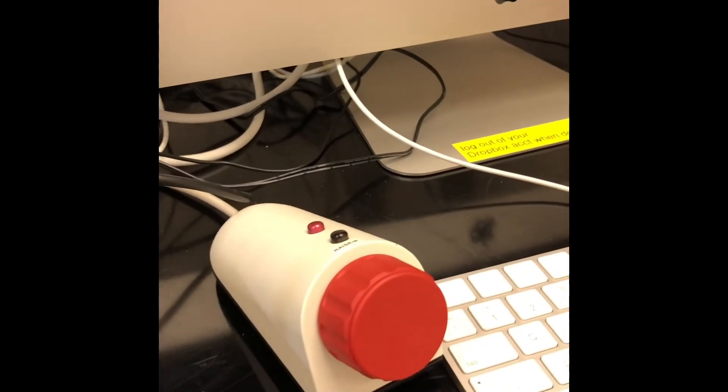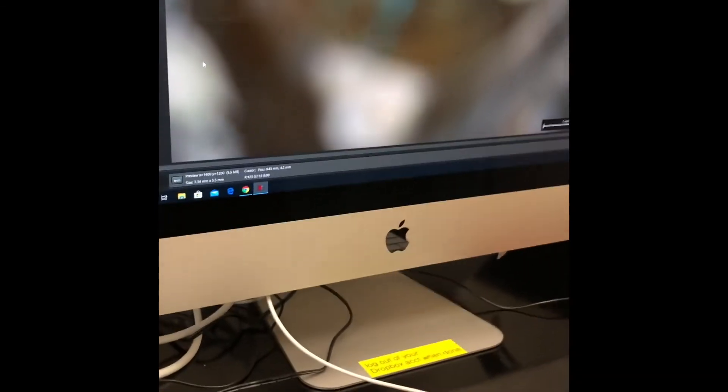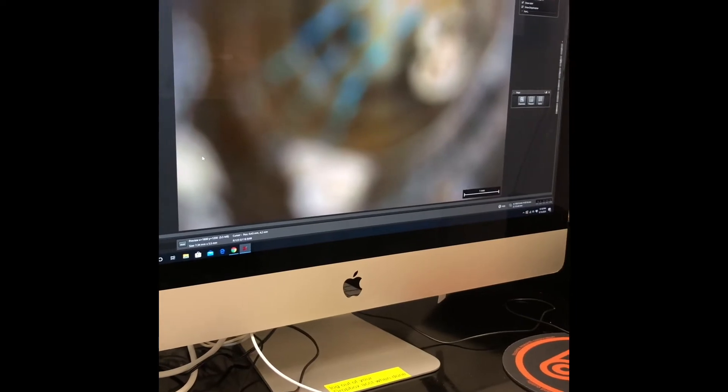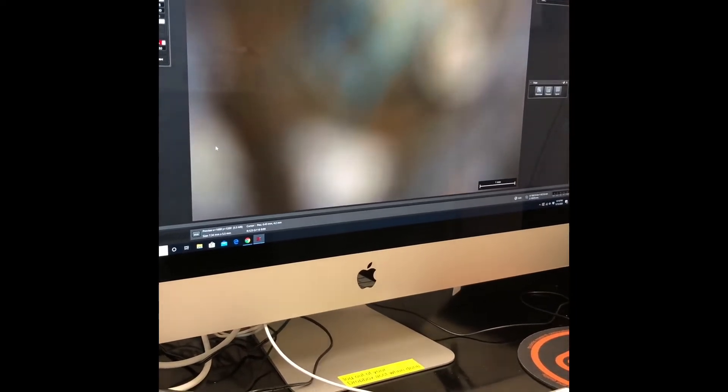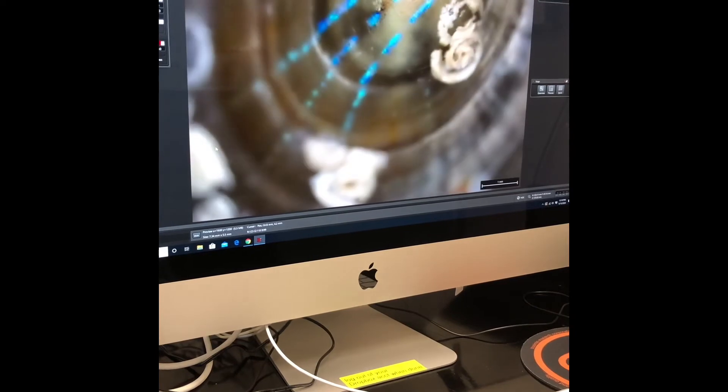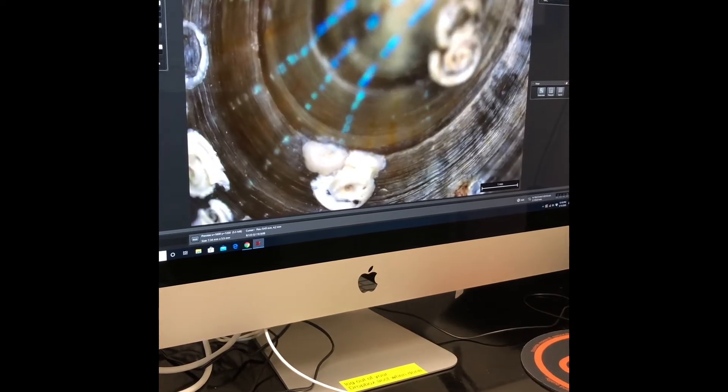We can set the focal height by rotating this knob to bring it into focus.